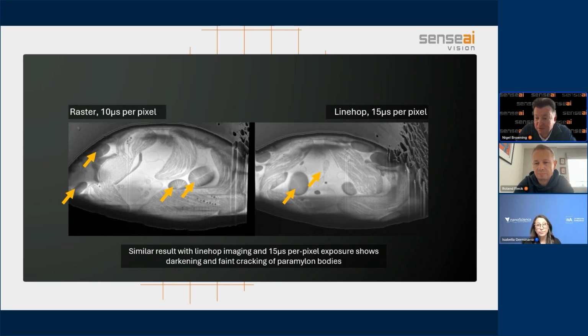And so essentially by having the sparse sampling, you have another degree of freedom in the way that you balance the electron beam that goes into the sample. And so that means that you have another knob to play with, another way of looking at it, another way of balancing magnification with sampling, with process and dwell time, to get the right answer to come out.